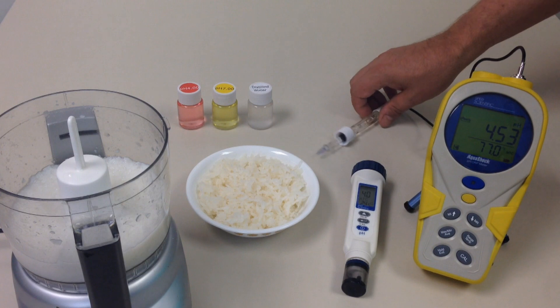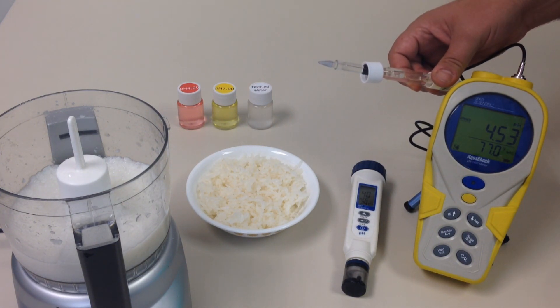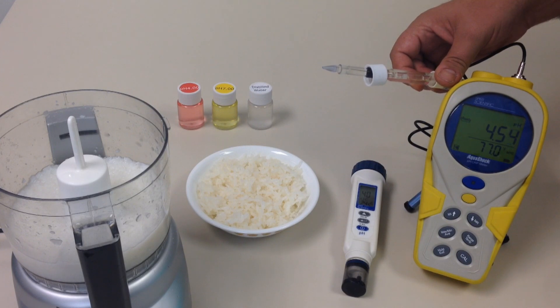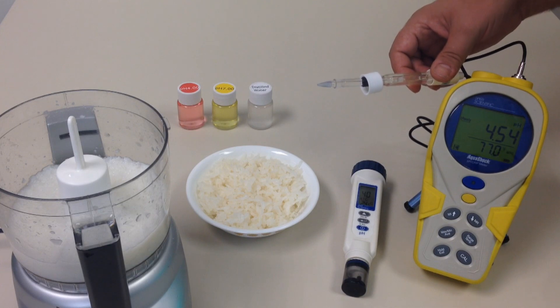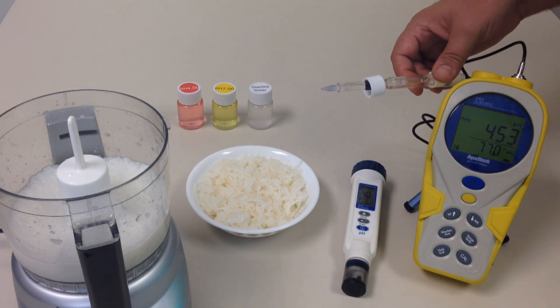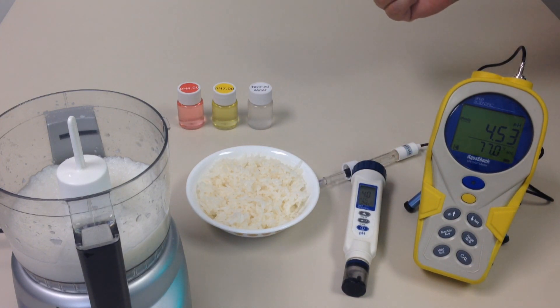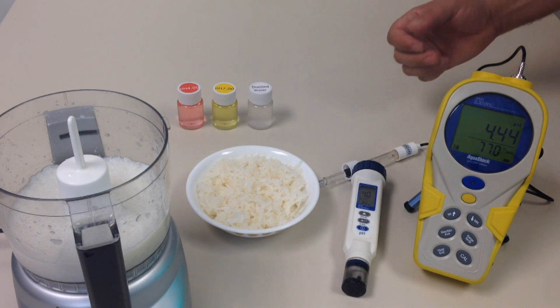With the AquaShock, we are using a spear-tip probe. The reason why we are using a spear-tip probe is because it is specifically designed to go into hard surfaces such as rice, cheese, or even meat. We have calibrated both of our meters with pH 4 and pH 7, as you can see back here, so we know that the readings we are going to be getting on our meters are accurate.